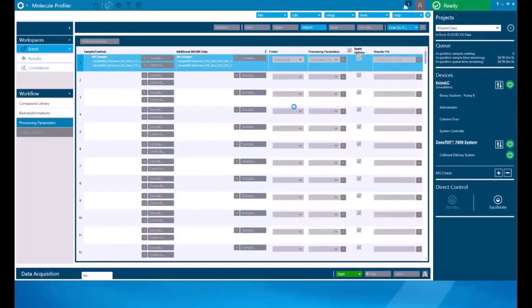So this is going to start looking for the metabolites. It takes some time based on the filters in your processing method and also the speed of your PC. My laptop configuration is an SSD with 32 GB RAM, which is required to run SCIEX OS, or the SCIEX OS processing PC, I would say, or SCIEX OS acquisition PC. I have the same configuration on my laptop, and it usually takes maybe a minute or a minute and a half to process one sample set.